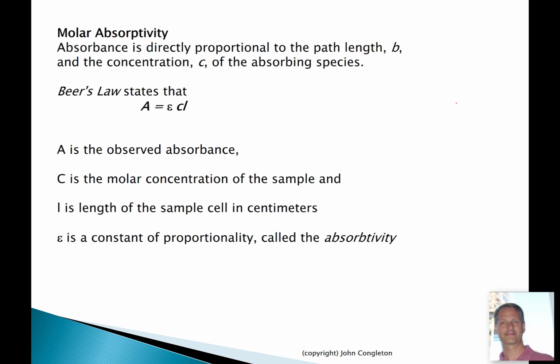Now the other thing that we're going to calculate is molar absorptivity. So we'll do that using Beer's law. The A in Beer's law is obtained from the spectra. That's your absorbance, right? C is your concentration. So for concentration, we're going to have some volume of acetone in hexane. If we know those volumes, then we can calculate what the molarity is, right?